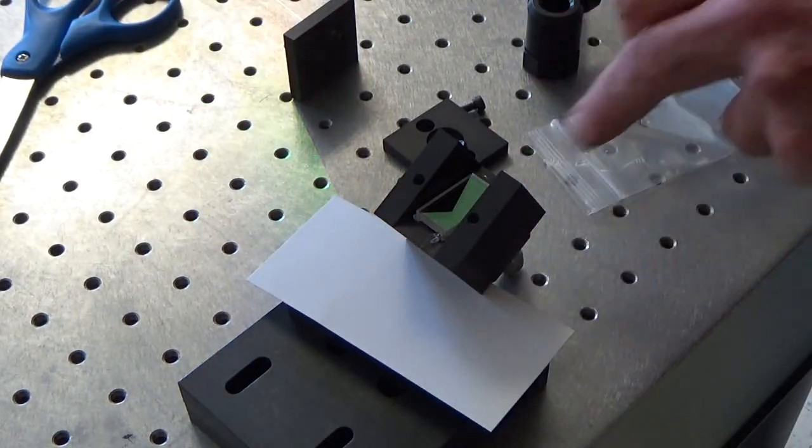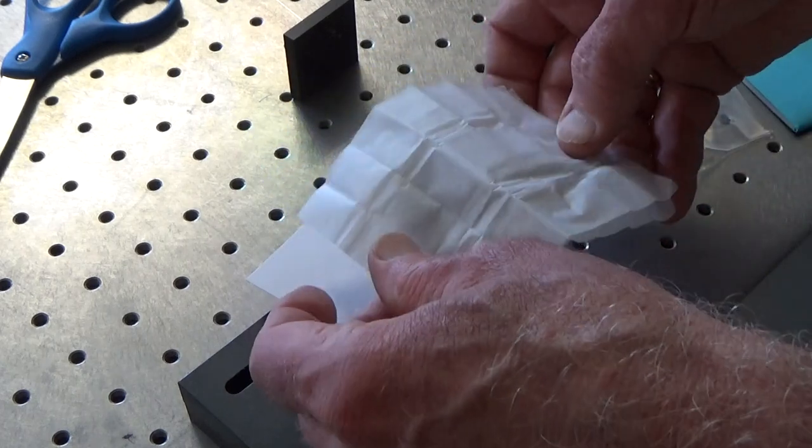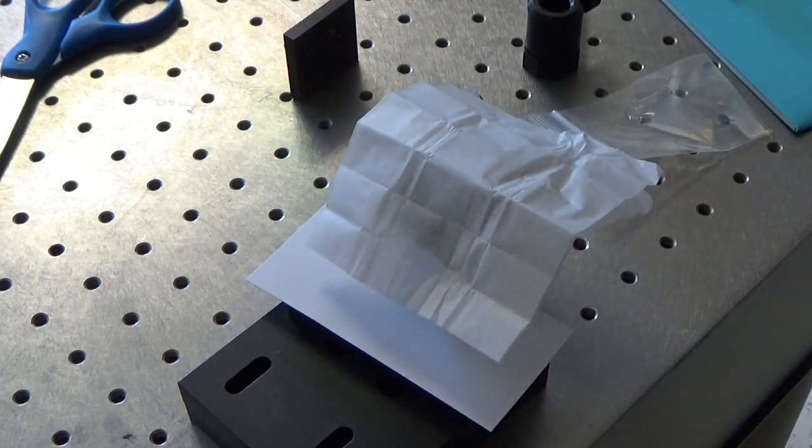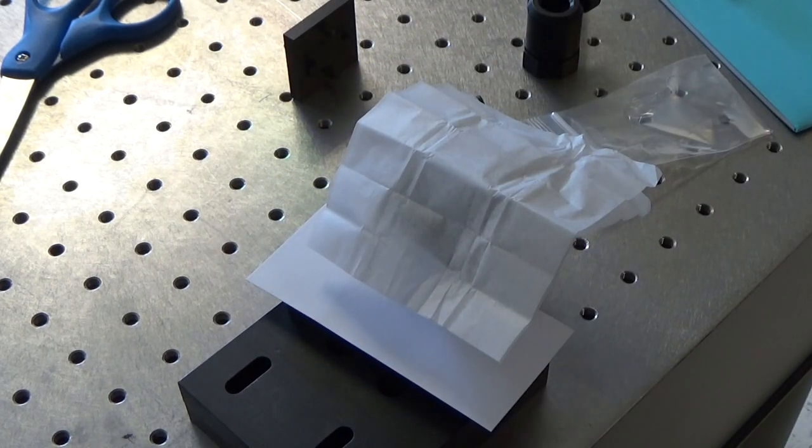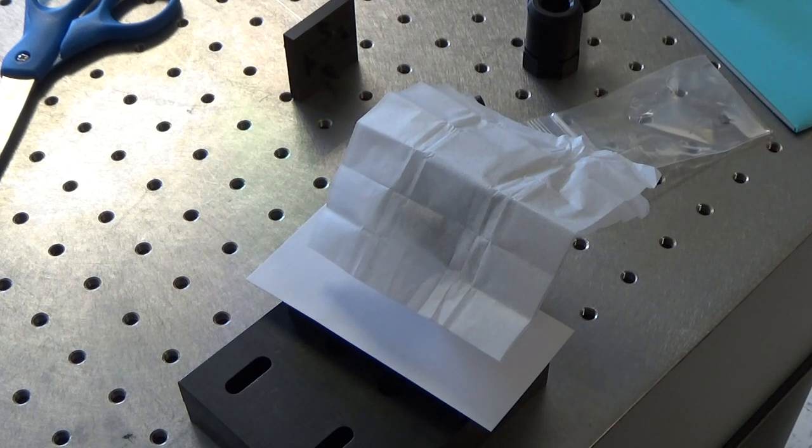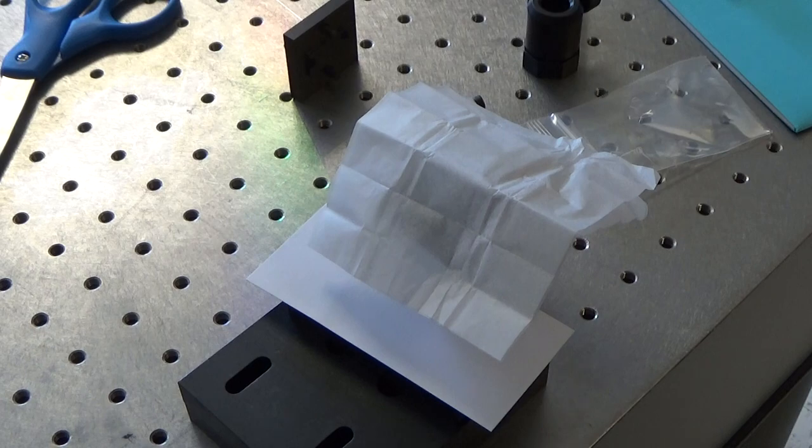That's it. All you need to do is let the silicon rubber glue dry about 24 hours and then you can replace the beam dump and the entrance plate. Thank you.